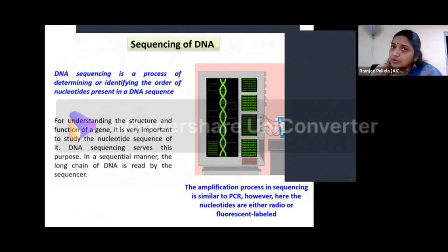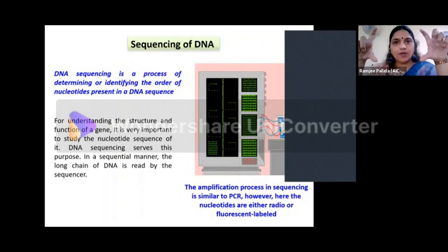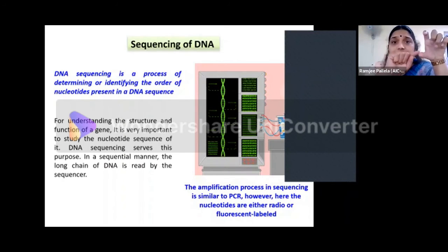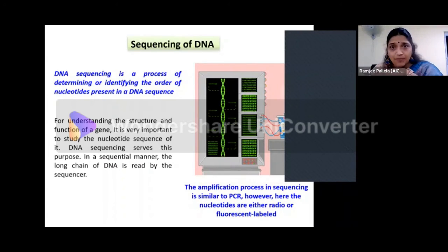What we will be doing now? We will be doing a sequencing. We need to know what is the sequence of this particular DNA that we have extracted and amplified. Whether whatever we amplified is there or not, we need to sequence it. Okay. And now, if for example, when I talk about genetic mutations, so this is a particular gene sequence. This sequence has to be there in the particular segment. But if a mutation here, or a single nucleotide point mutation, SNP, is there, then this thing will not be there in my sequenced amplicon, right?